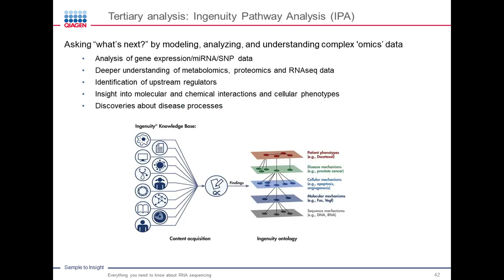For tertiary analysis, we have the Ingenuity Pathway Analysis. Basically, it's asking what's next by modeling, analyzing, and understanding complex omics data sets. And what I like to think of it is that it is a very much automated PubMed system. Break it down basically into its roots.